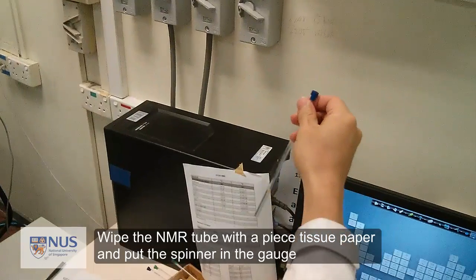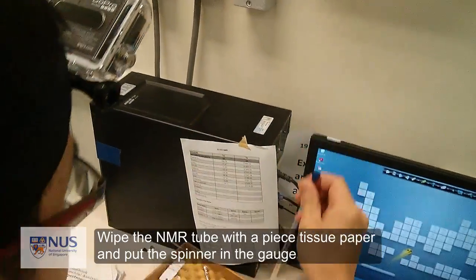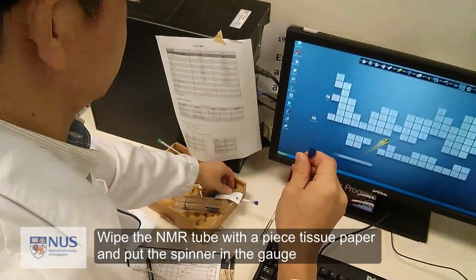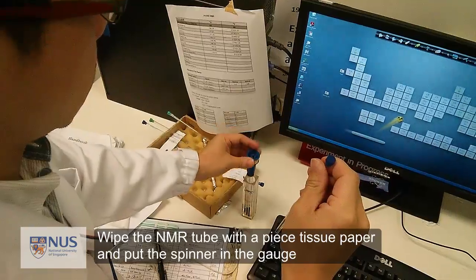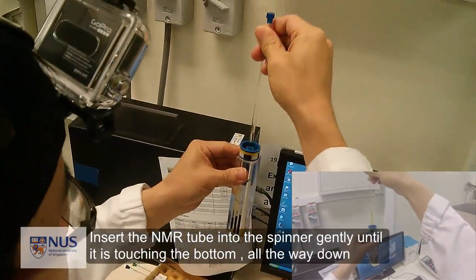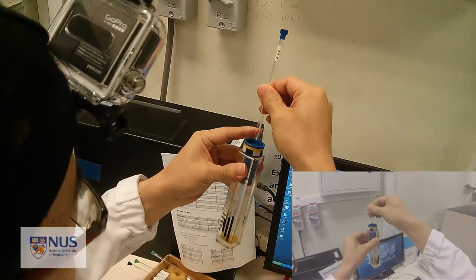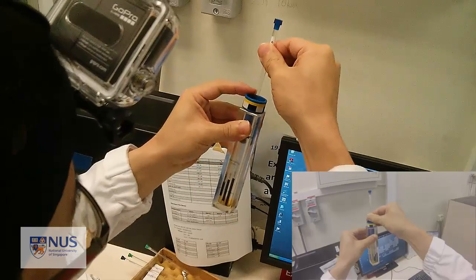Wipe the NMR tube with a piece of tissue paper and put the spinner in the gauge. Insert the NMR tube into the spinner gently until it is touching the bottom, all the way down.